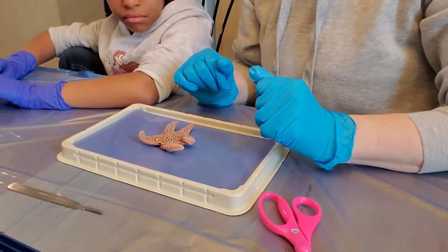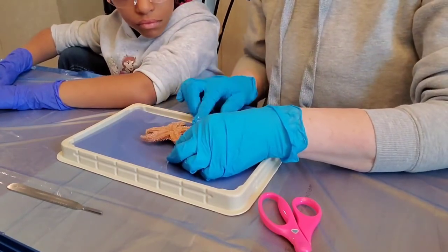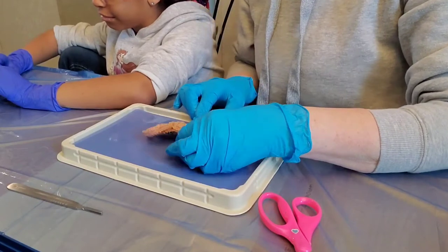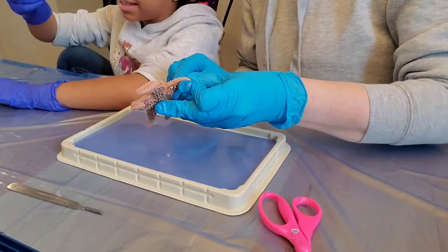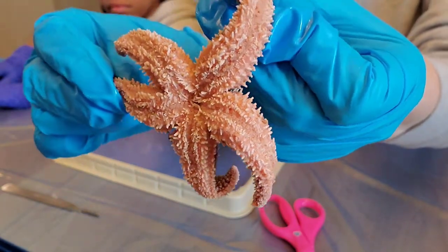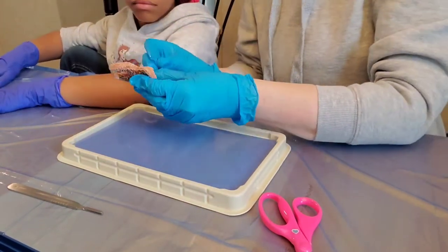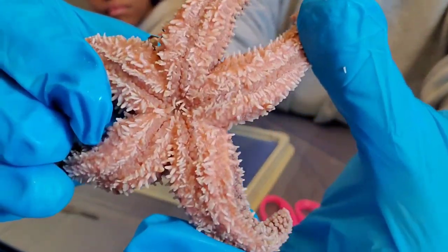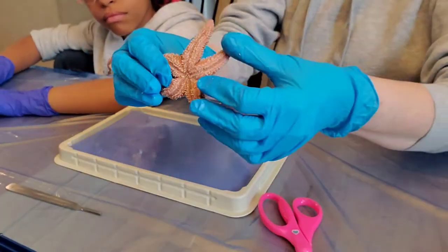If you turn the starfish over you will see tiny tube feet which line the ambulacral grooves. Here are the grooves — they allow the starfish to move and latch on to prey. In the center of the starfish you should be able to see the mouth. Right there in the exact middle — that's the mouth of the starfish!